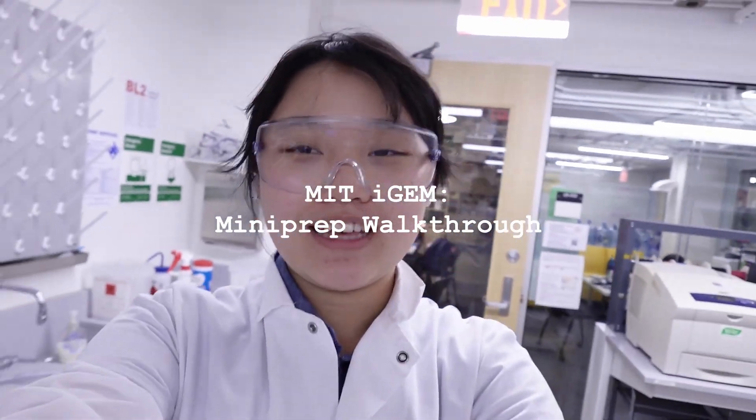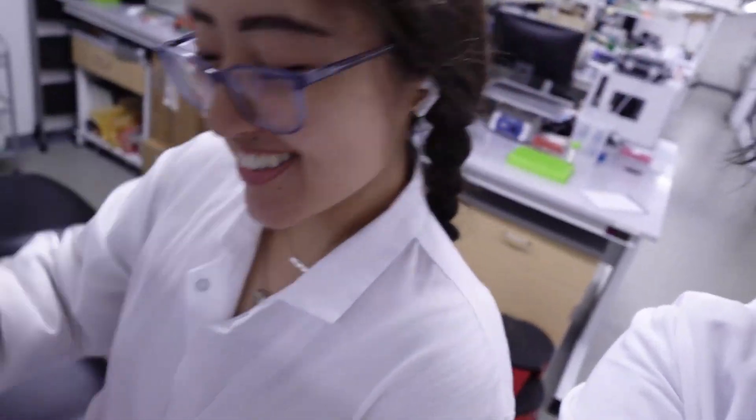Hi, so it's Allison here. I am in the lab with KT. KT, say hi. Hello. And we are going to be showing you how to do mini preps today.